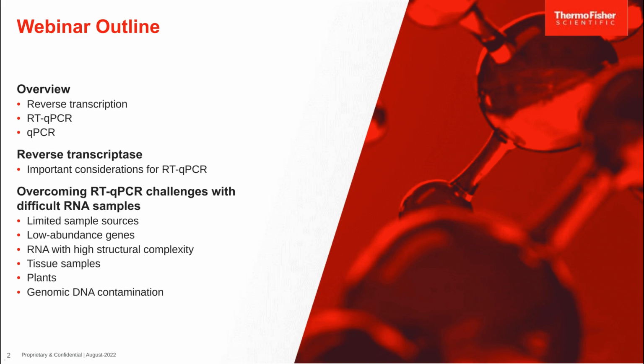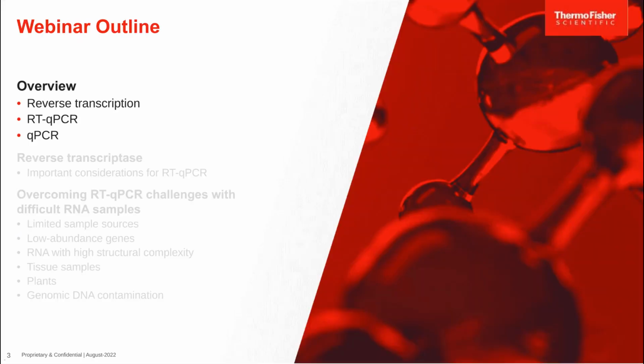appreciated. During this webinar, we will give a brief overview of reverse transcription and reverse transcription qPCR or RT-qPCR. Then we will discuss the attributes of reverse transcription enzymes that are critical for successful RT-qPCR experiments. The rest of the time will be dedicated to tips and tricks for overcoming RT-qPCR challenges, particularly the challenges that occur when working with very difficult RNA samples. Okay, so let's get started with the overview.